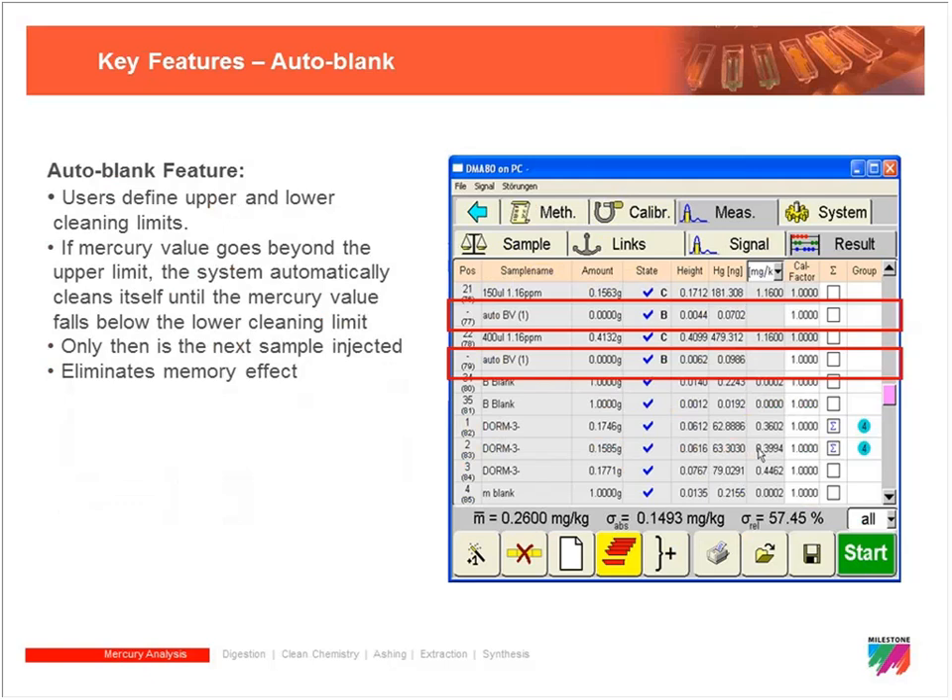Another key feature is the auto blank. The user defines upper and lower cleaning limits. If a sample value exceeds the upper limit, the system automatically cleans itself until it records a blank value below the lower limit that was set — it won't inject another sample until the system has been sufficiently cleaned. This virtually eliminates the memory effect automatically.